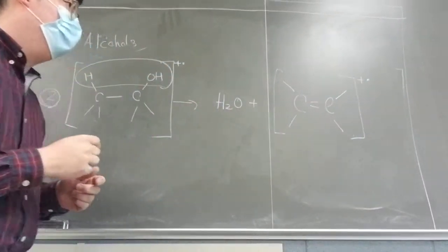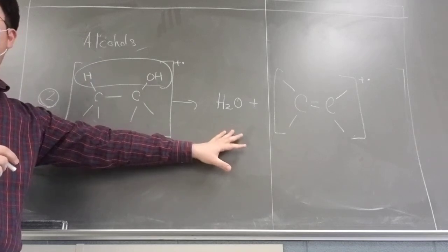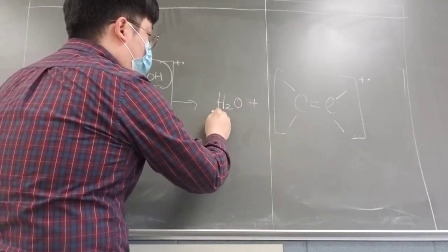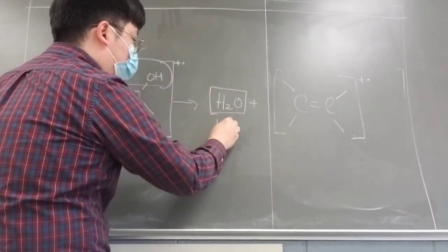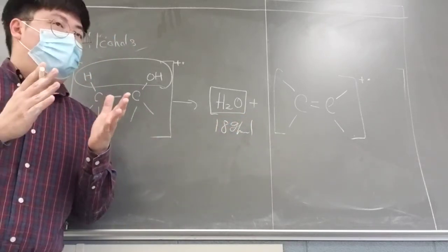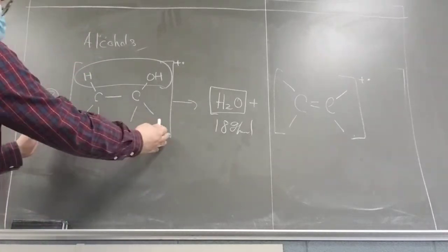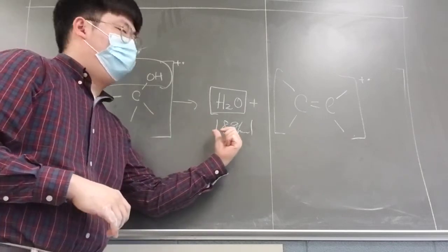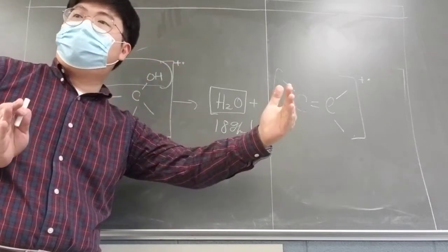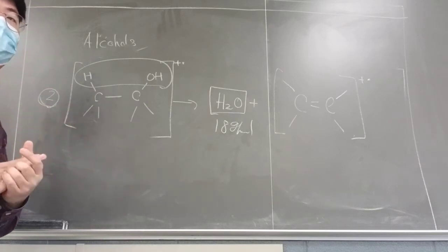So, this one. For alcohol compounds, this is another possible scenario you can see in the mass spec data. The only thing you really need to look at here is the water. Water is 18 grams per mole, 18 AMU. So you may not see a very clear molecular ion, which is your whole compound's molecular weight, but that minus 18 may appear as a peak on your mass spec. You can see, oh, this might have gone through dehydration instead of other cleavage.